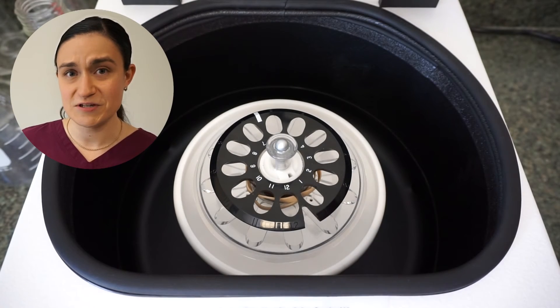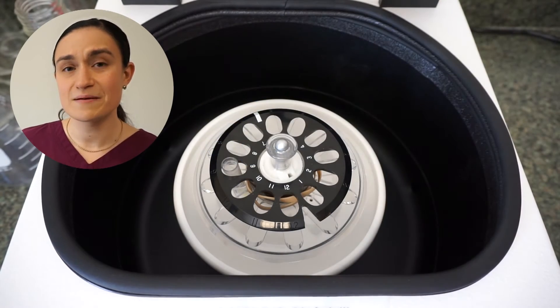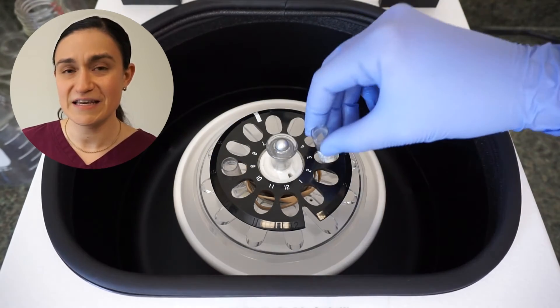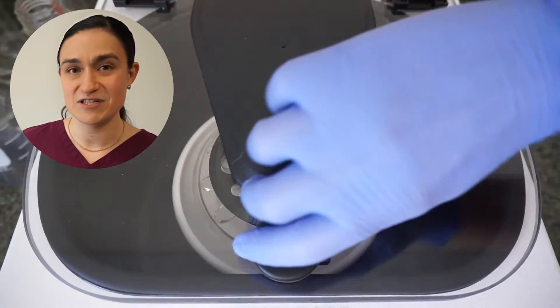If you're loading two tubes — either two blood tubes or a single blood tube and a counterbalance — place them across from each other on the rotor like you see here. It doesn't matter which slots, just so long as they're directly across from each other.